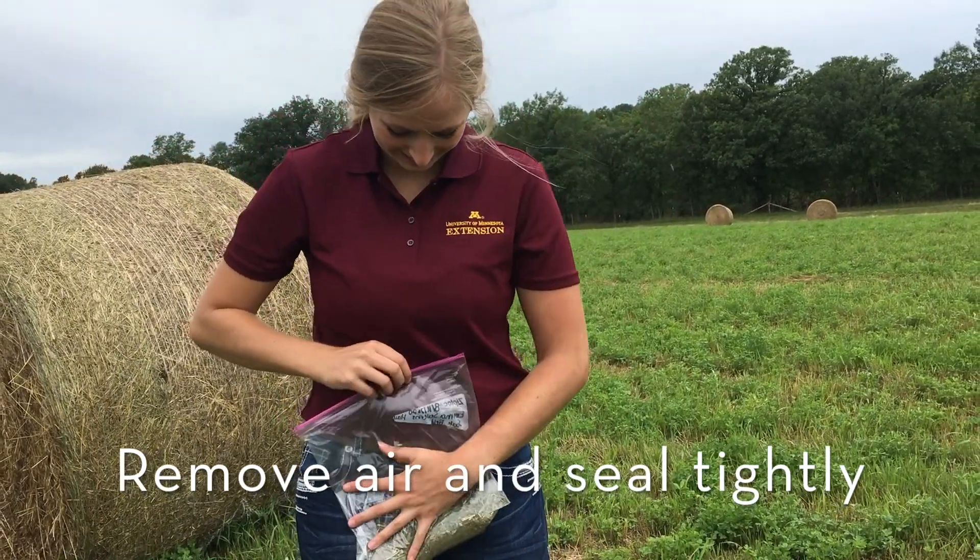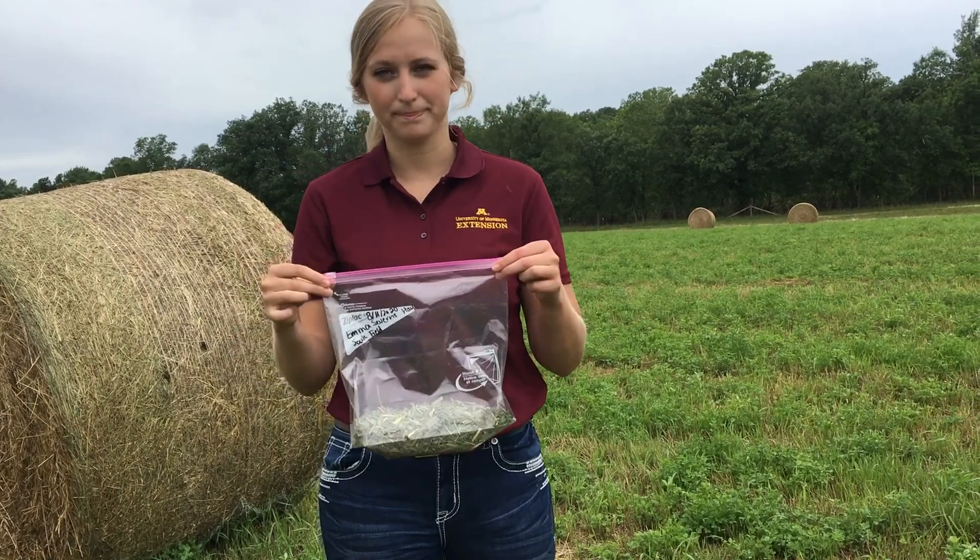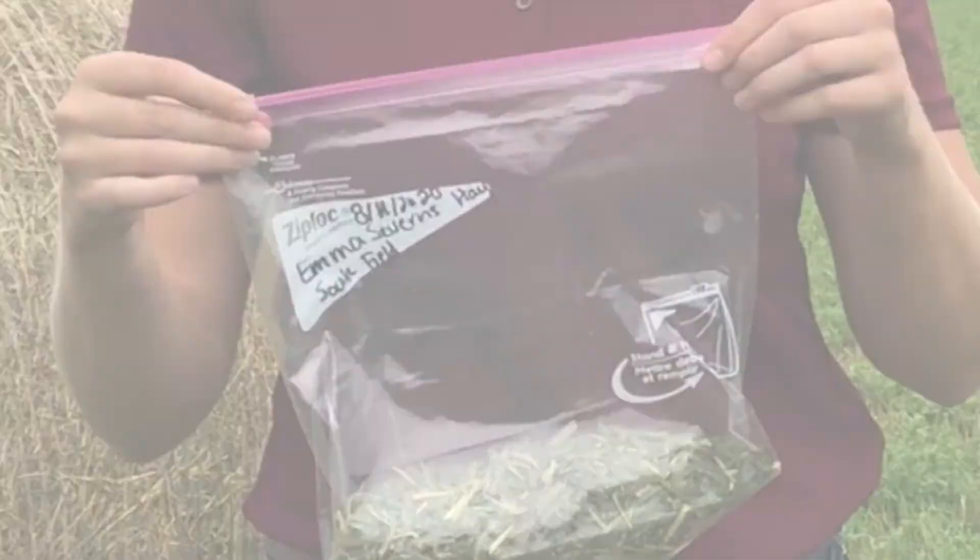Vacuum sealing is highly recommended for samples that are unstable, being shipped long distances, or for analysis susceptible to changes during fermentation.